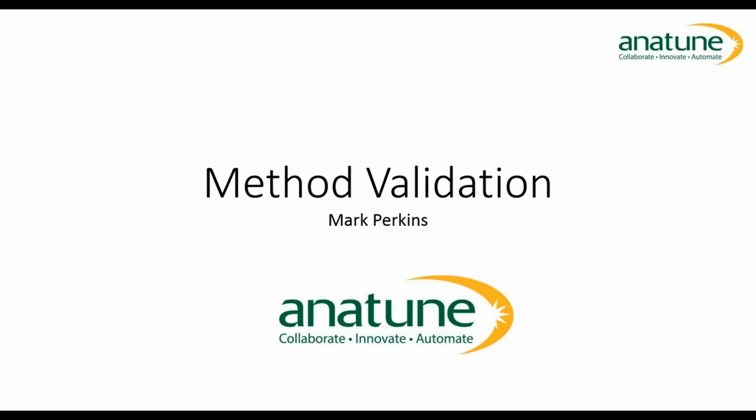Thank you, Vaughan, for that introduction. And as Vaughan's mentioned, today's webinar is looking at method validation on SIFT-MS. So some of the previous stuff we've talked about in previous webinars has been looking at developing methods to do analysis on samples, very much as we would for other chromatography techniques. And one of the most important things you can do when you've developed a method is to validate it.